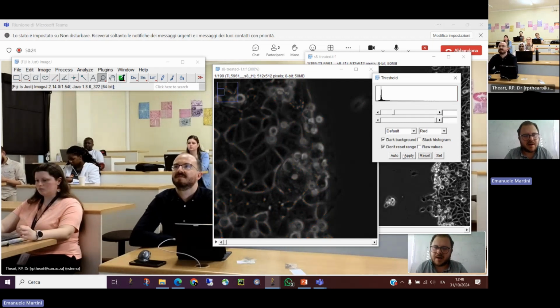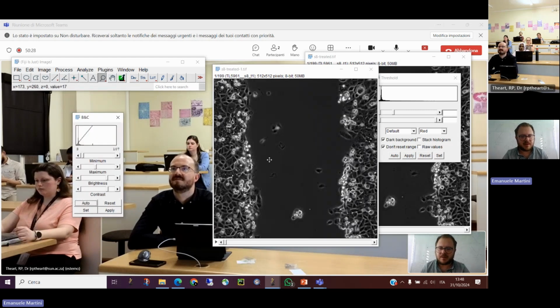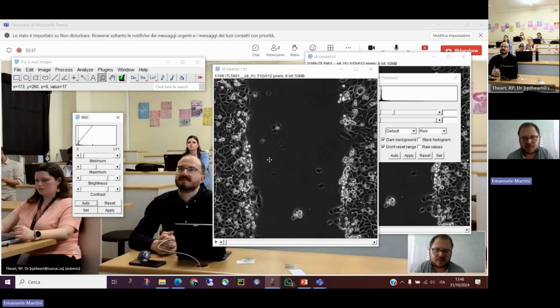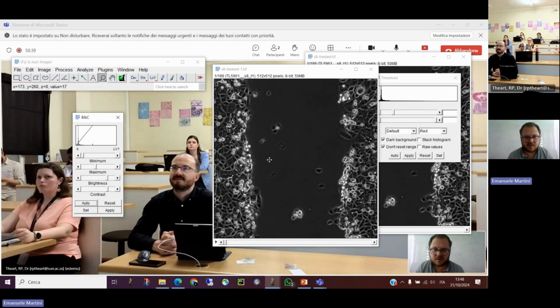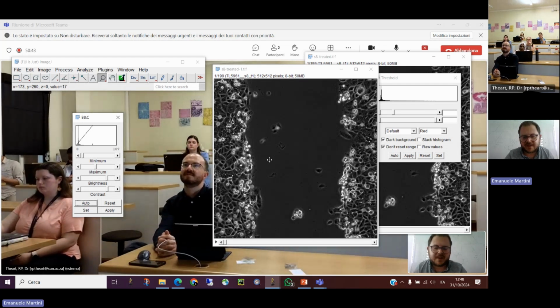So what you usually do in this kind of analysis is think, how can I enhance, highlight my cell layers with respect to the wound? You can use some filter to enhance them.